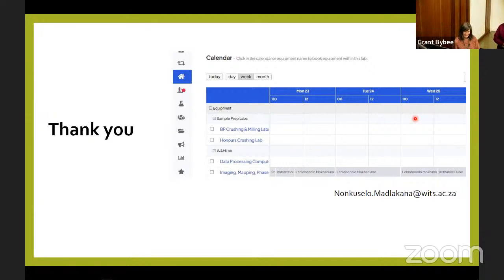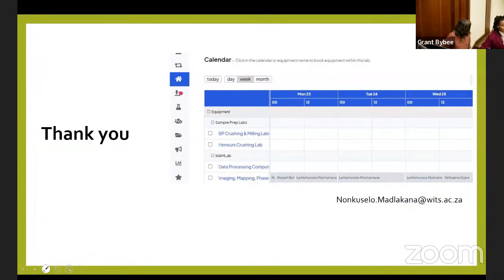Please, Scott. With the quartz, was that a titanium map that you were showing that had the zoning? So that's also the CL map. Oh, that's the CL image. That's if you want to know what element causes the growth zoning, you can do the imaging at high resolution. So the mapping at high resolution, you can also map the information and see why it's growing in that way.